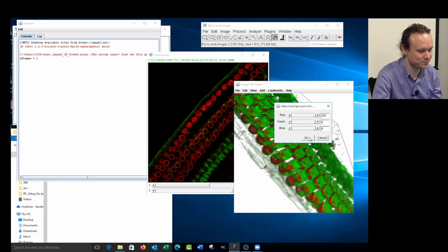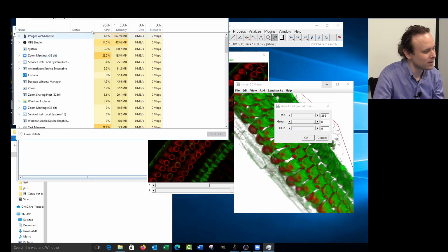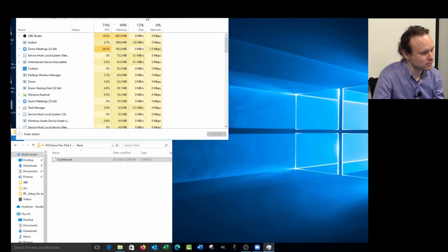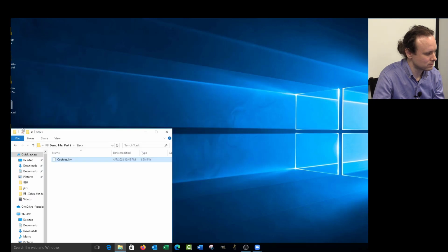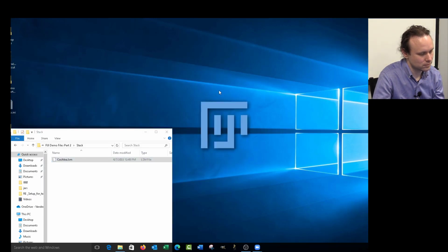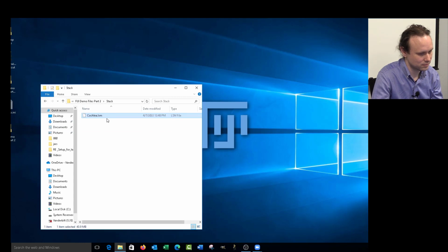And we're going to wait. All right. Sorry about that. It's a great example of why you should use the workstations when you're dealing with big data.